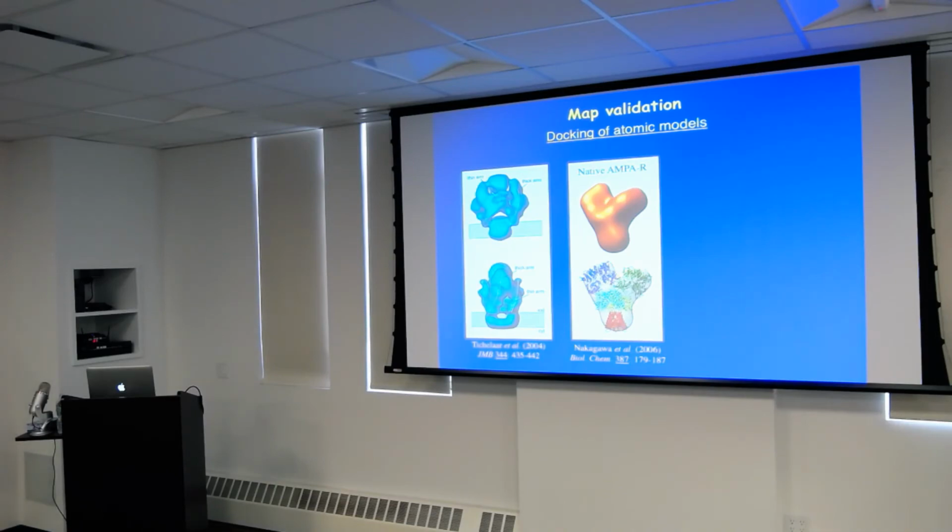One quick question. Given the improvements that we see in the 3D classification algorithms that are being used nowadays, what is the real advantage of doing 2D classification to find homogeneity in your data set before moving on to 3D? There is none. So 2D classification, most people these days do just to get rid of bad particles, ice particles and all the crap. But they don't use it anymore really to get homogeneity into particles. That's all done in the 3D classification step.